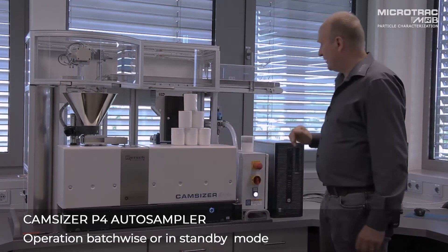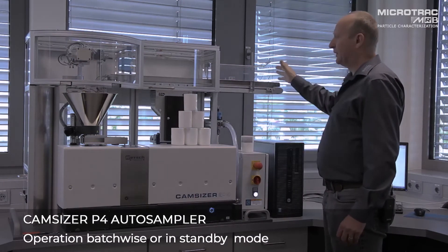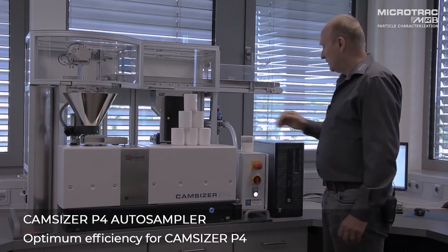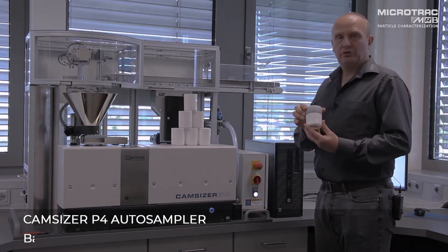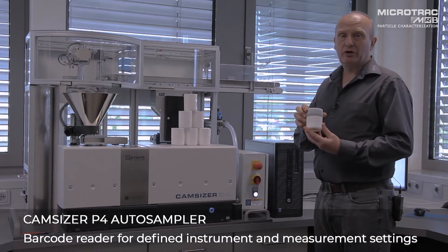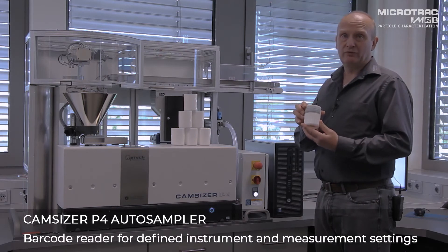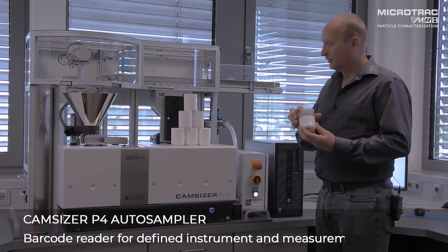We can operate in a standby mode, at which point as soon as a beaker is placed in position we'll start the analysis process. The cups can be marked with a barcode which will be read, and that will give the information for both the method file and the file name for the particular sample.